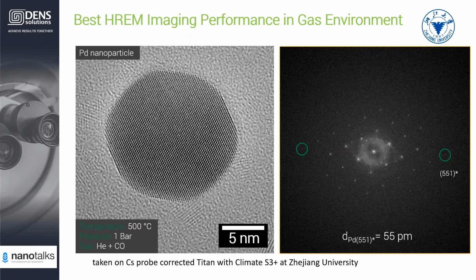We're also getting another question regarding the calibration of the nanoreactors. How is the nanoreactor calibrated? And they want to know if the time difference between the different components, such as the GSS or the MS, depends on the instrument's geometry.